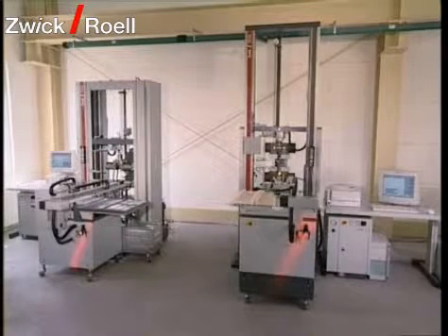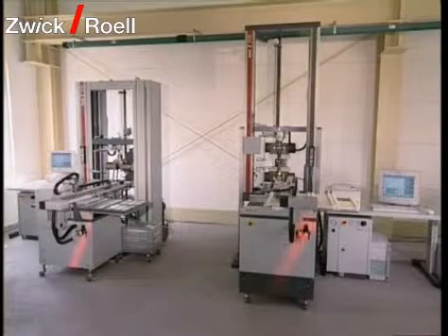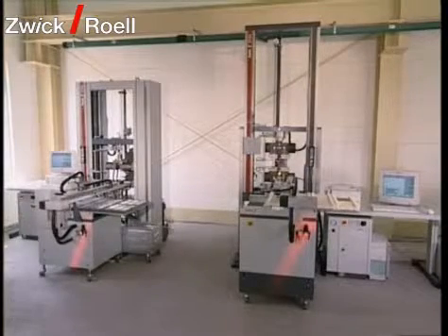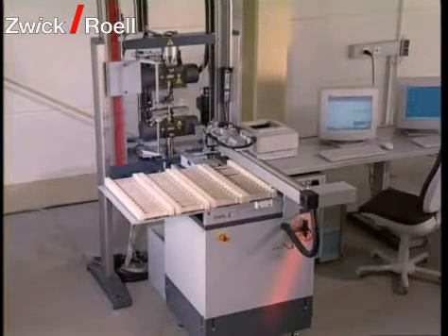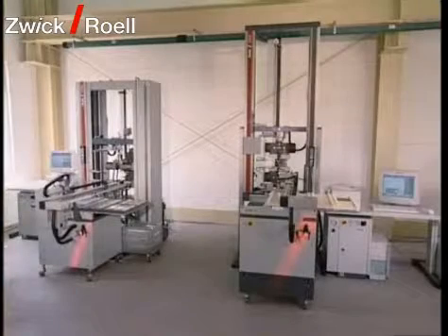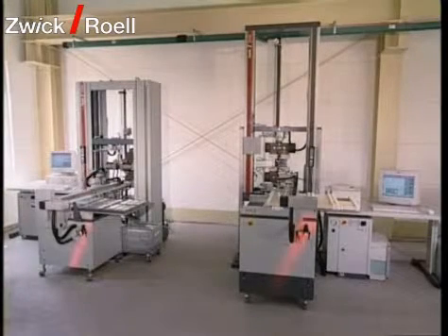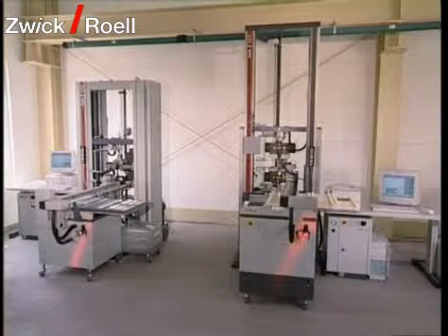Various materials can be tested with the X-Linear Automatic Specimen Feeding System for plastics and metals. The functional operation of both testing systems is more closely explained in the following film.